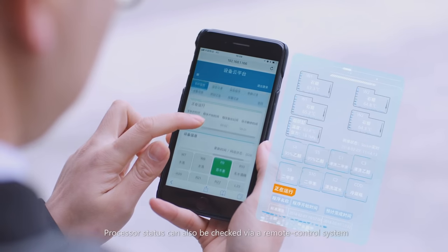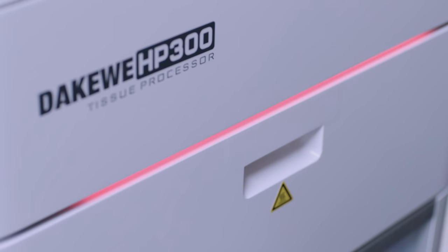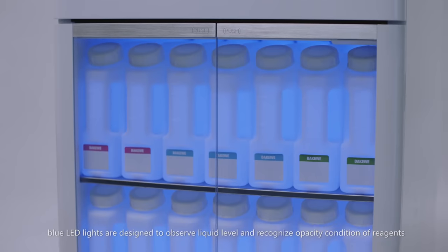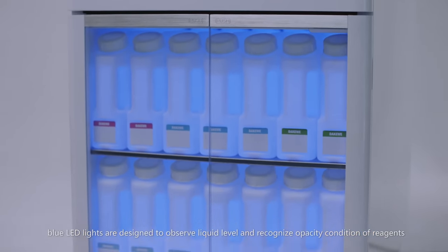Processor status can also be checked via a remote control system. A light alarm makes it easy to check the current status. Blue LED lights are designed to observe liquid level and recognize the opacity condition of reagents.